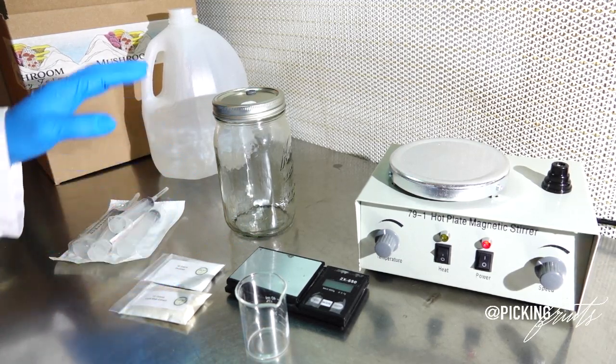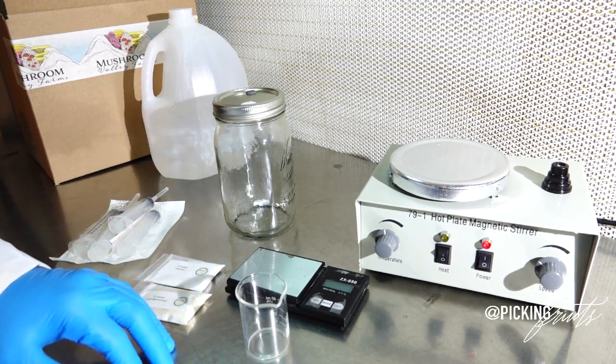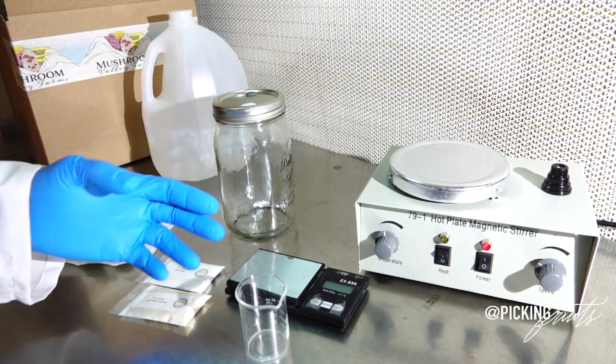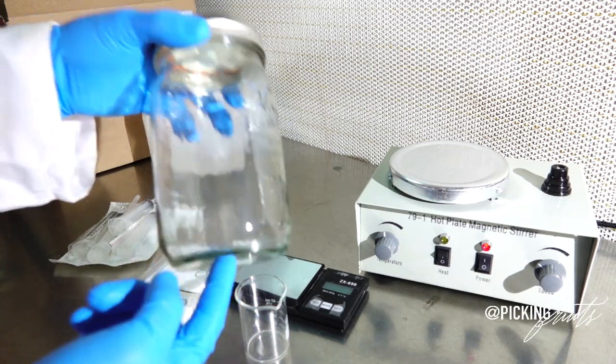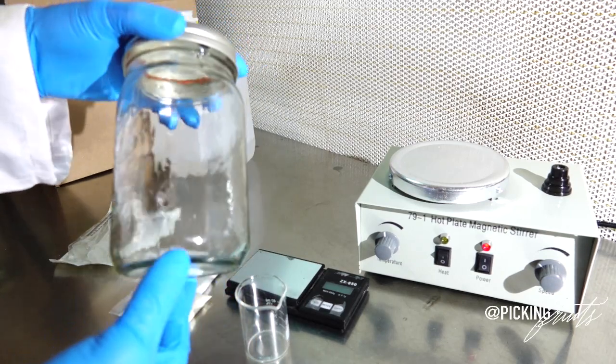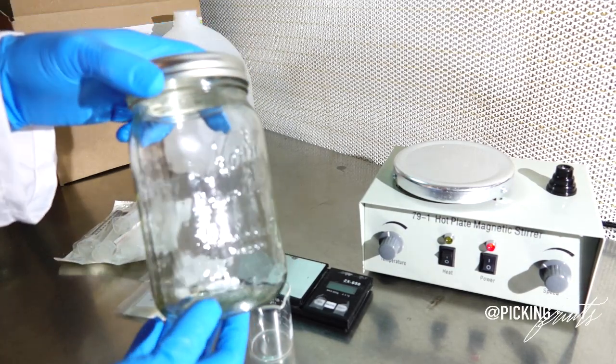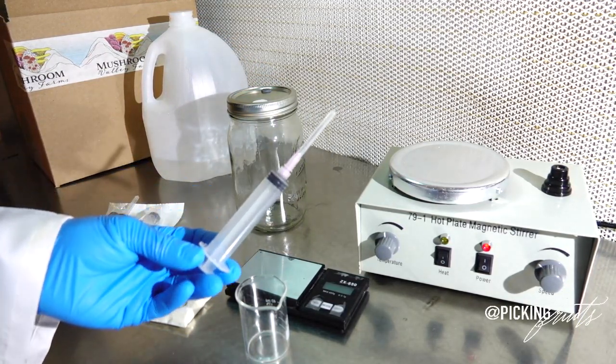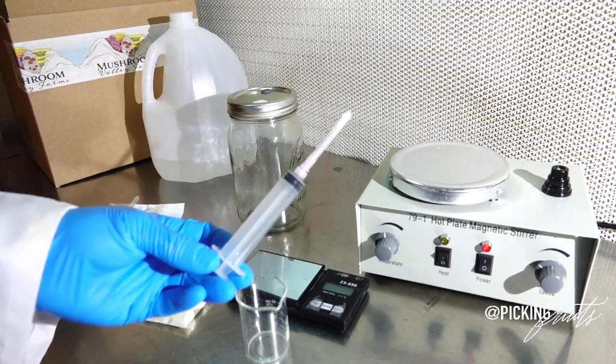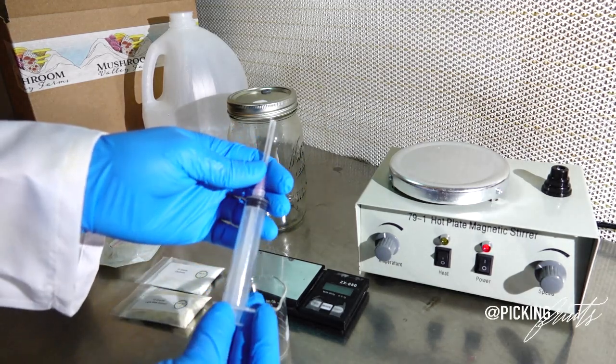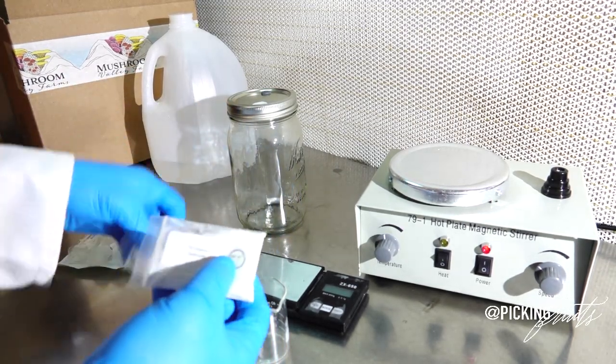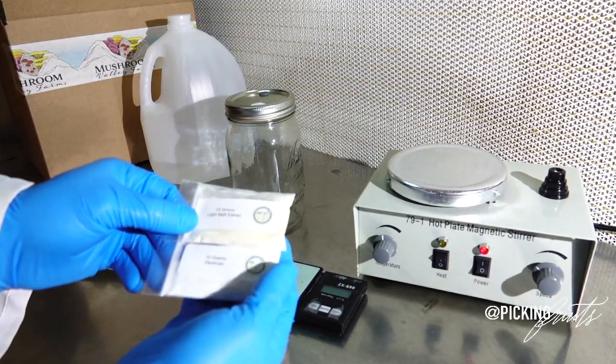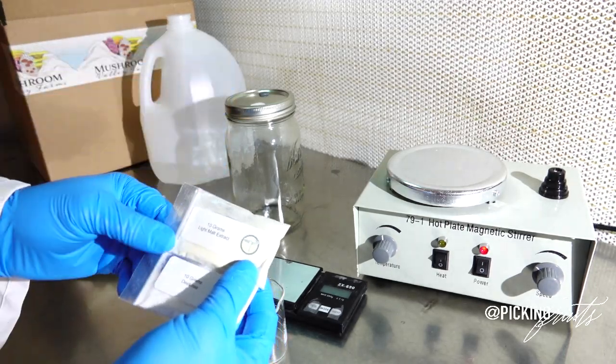Now, if you don't have access to the kit or if you didn't buy the kit but you still wish to start your mushroom journey and make a liquid culture, you could definitely source all of these things separately. It will take some time and it will take some researching. But you want a glass vessel that will withstand high pressure and high temperatures because you do have to put this in an autoclave or a pressure cooker. If you need to source syringes, you could buy them online or you can go to a tractor supply or any kind of rural farm supply store that will have syringes and needles for livestock. And if you don't have access to dextrose or light malt extract, you could definitely use sugar in the raw, which is a natural cane sugar, or you could use honey if you're not vegan.